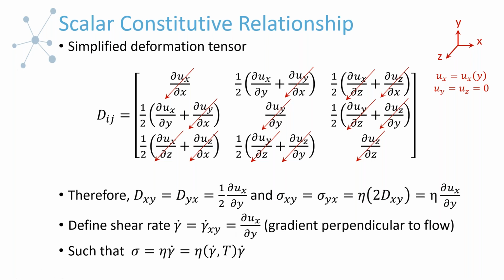Okay, so that's the expression that everyone is most familiar with, and you can apply it when you are using instrumentation that is controlling the flow field in a well-controlled simple field. Ultimately, in the talk today, we're going to go through how the stress and the shear rate are calculated for some of the different types of instrumentation.